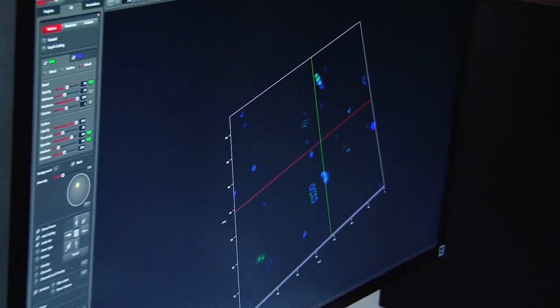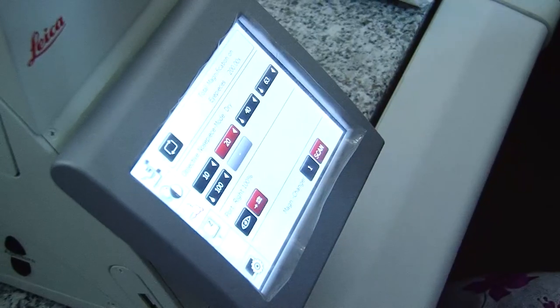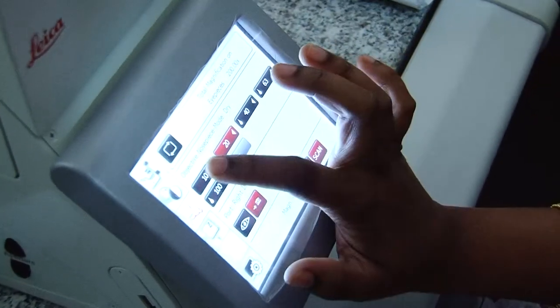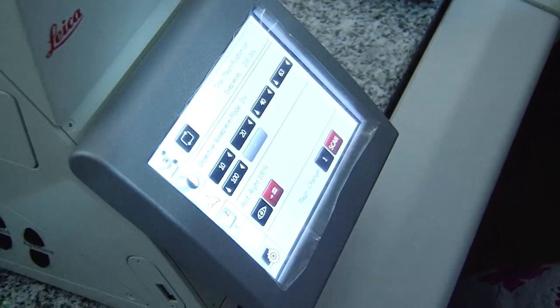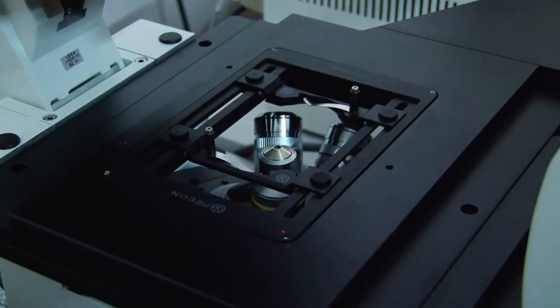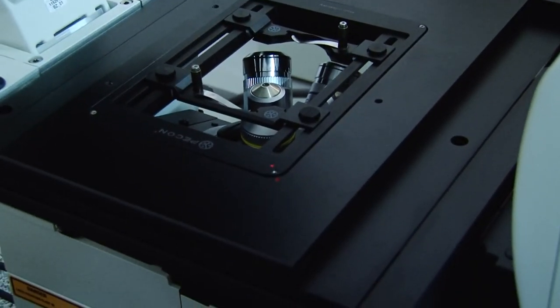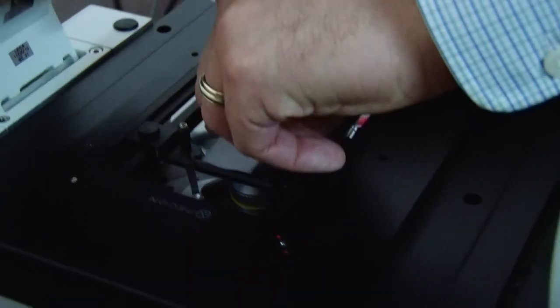Okay, let's have somebody else jump up here. Who else wants to jump up here? Somebody? Okay, I want you to go to 10X. Okay, so the different objective came in. What we're gonna do is put a slide up here. Different slide. Okay, now see that? That's what you're going to be looking for. Okay. We're going to put this slide on now.